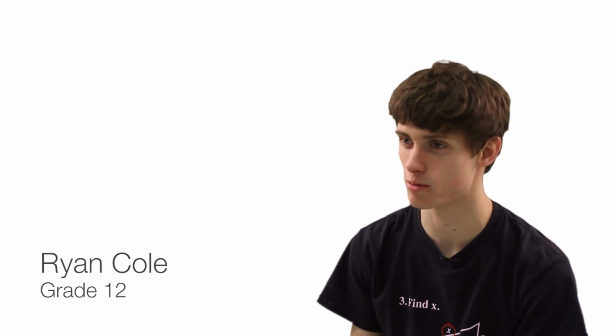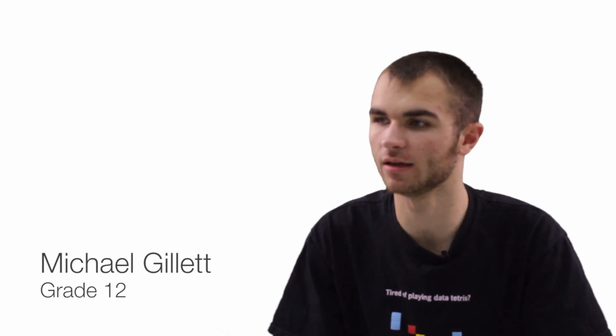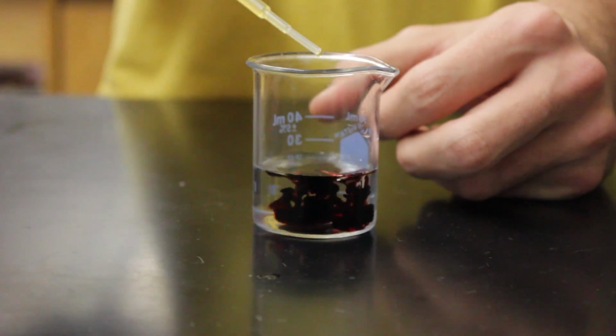Think back to your high school chemistry class. What do you remember most clearly? Chances are it was a fun lab demo. Laboratory experience is crucial to gaining an understanding of chemical processes as well as keeping students engaged. But most students don't have the opportunities to do these hands-on activities until later in high school.